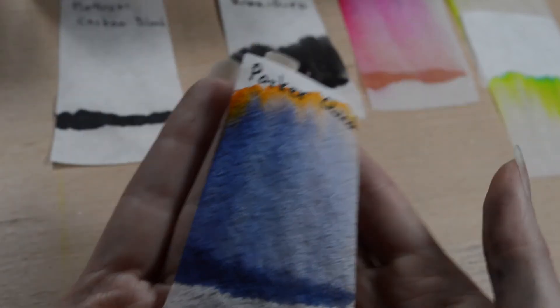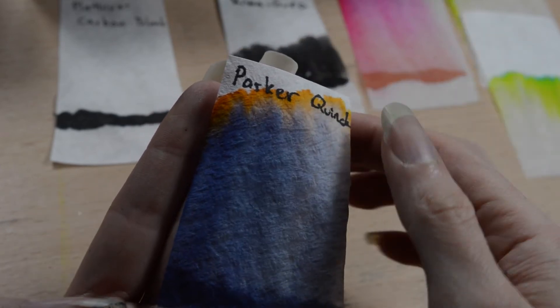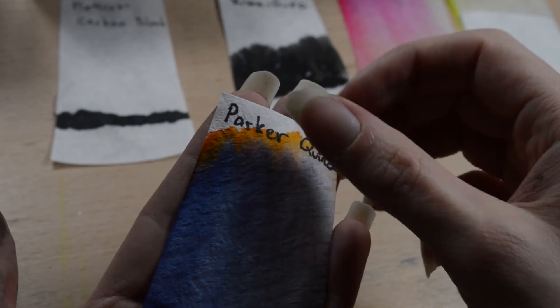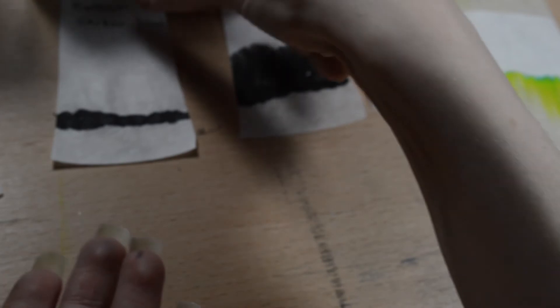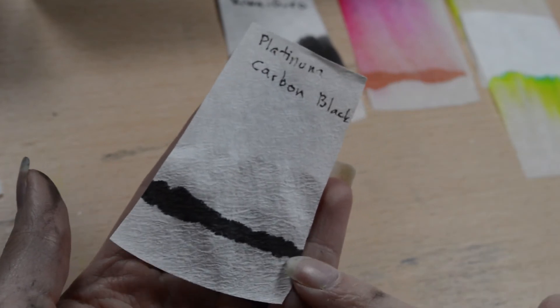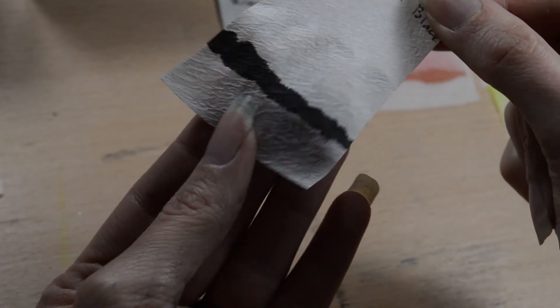Then we have Parker Quink, which has blue and orange in it. It's really weird that there's this orange edge here. But that's what Michelle also noticed — that some of these black inks have a yellow and orange component. Then we have Platinum Carbon that didn't go anywhere. This is a good sign — it's really waterproof, and I think that's the reason why it smells like Indian ink. It didn't bleed at all.